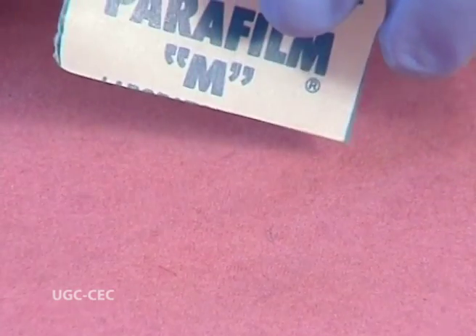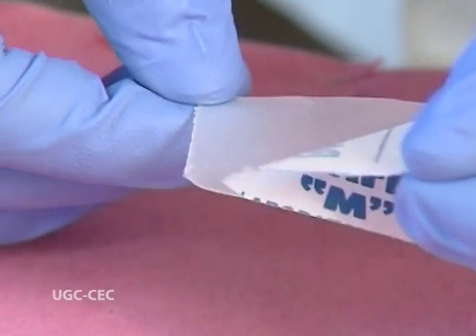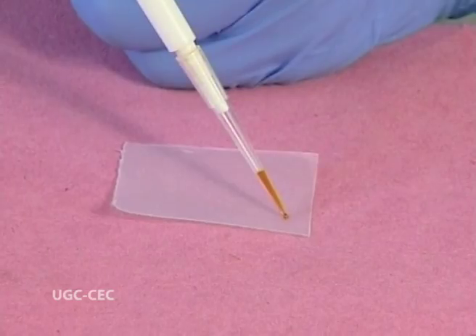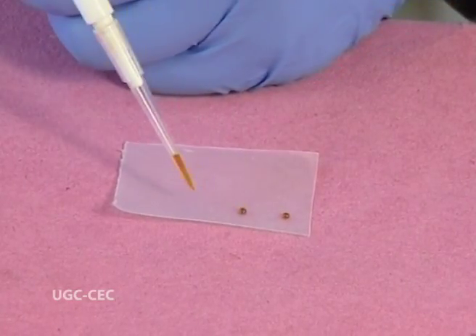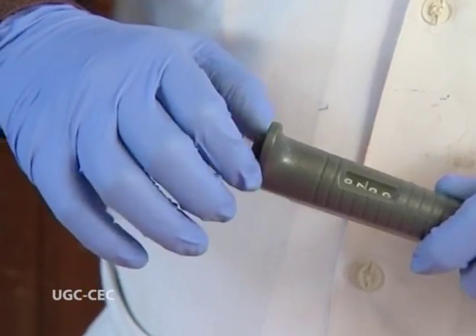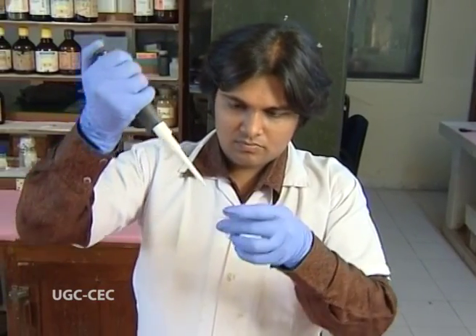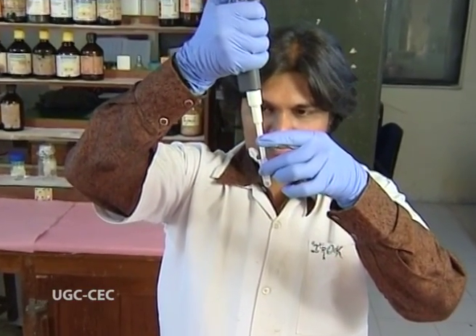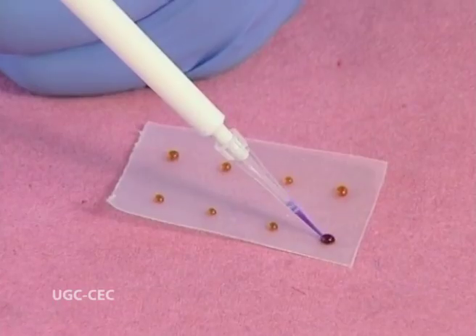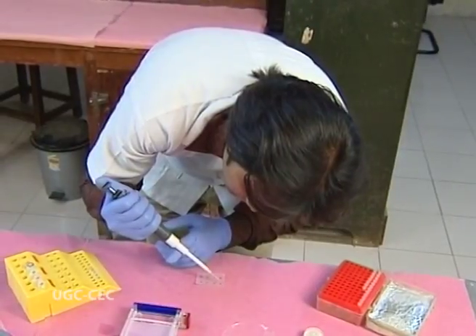Now after condensation, the gel is ready for loading. One has to mix BPB, that is bromophenol blue. It's a loading dye which is mixed with the sample, and hence parafilm can be used for loading it. Parafilm is very slimy and hence it helps in mixing it properly. So we just place drops of BPB, that is 2 to 3 microliters approx, onto it, and then we take the sample and we mix it thoroughly. After mixing, the sample is ready for loading and hence it can be loaded into the wells.